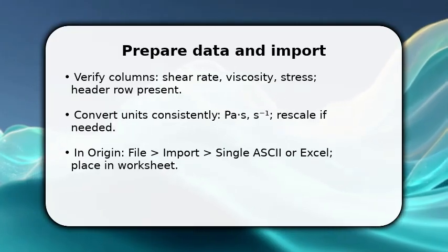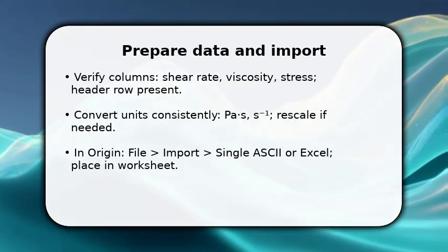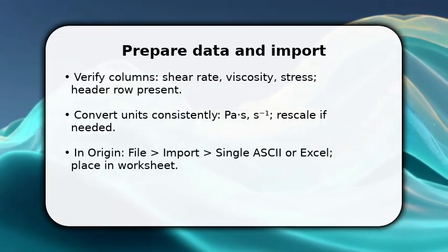You start by confirming your columns are correct: shear rate, viscosity, and stress. Once done, convert all units to a consistent system like Pa·s and s⁻¹ so fits and labels are meaningful.